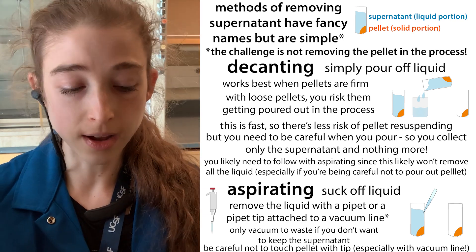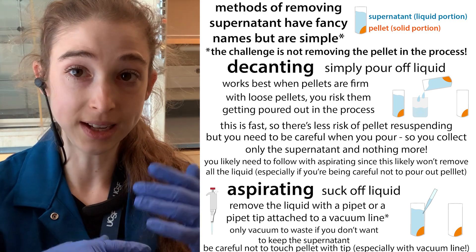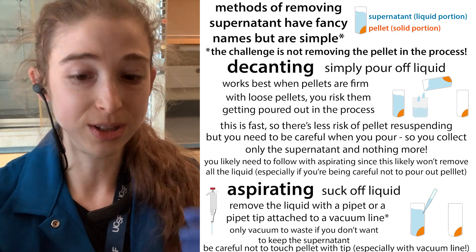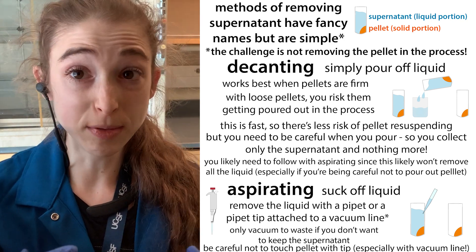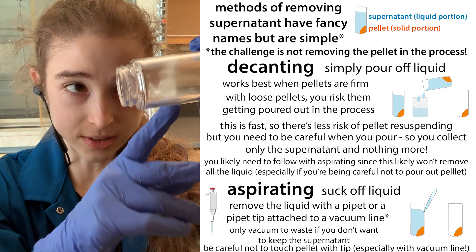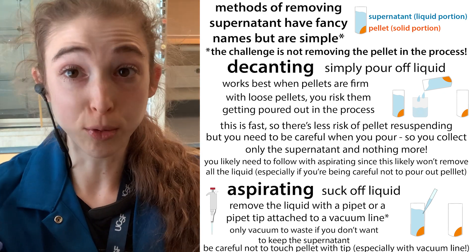The easiest way to remove the supernatant is to literally just pour it off — this works really well if you have a firm pellet and it's fast, so there's less risk of the pellet and supernatant mixing back together. However, you have the most risk of pouring out your pellet. You want to be really careful. Sometimes there's a lip on the tube, so if the pellet starts moving you can still capture it there. This is called decanting.